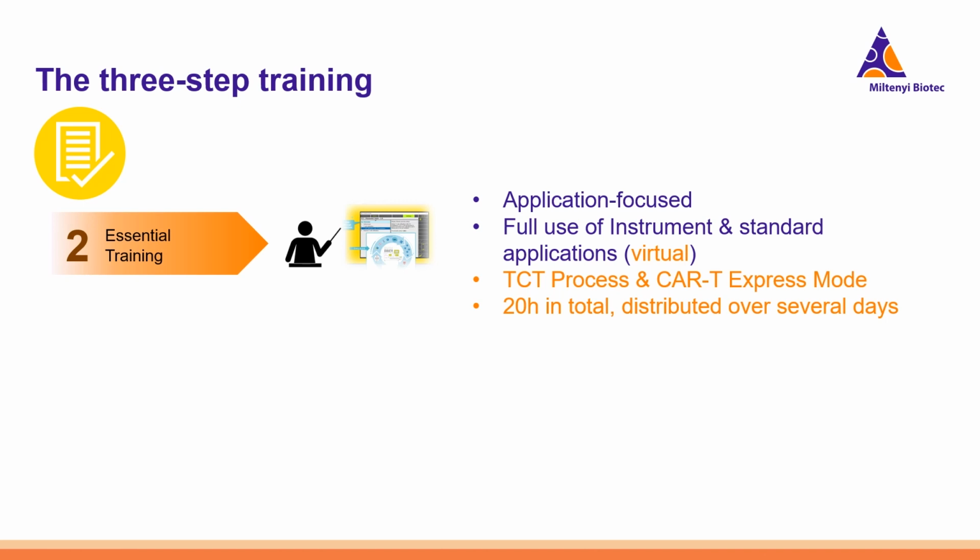But of course, no human can sit concentrated for 20 hours. So how that usually looks is that we arrange with the host site different times when the different parts of the training will be transferred. And the goal there, together with the instrument introduction, is to have the staff ready both in terms of knowing the instrument, but also knowing the applications on the instrument and having a somewhat broader background knowledge on what's going on, so that they can then perform the final step of the training more readily and actually profit from it more.